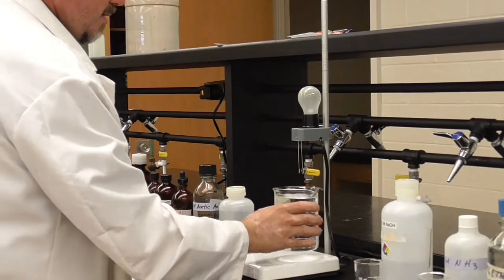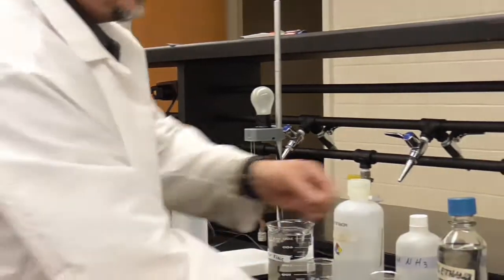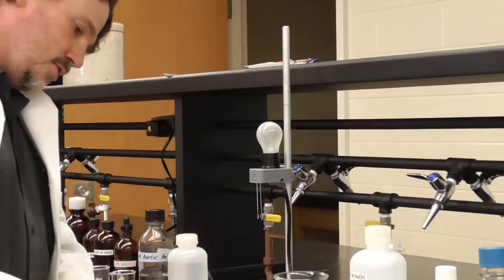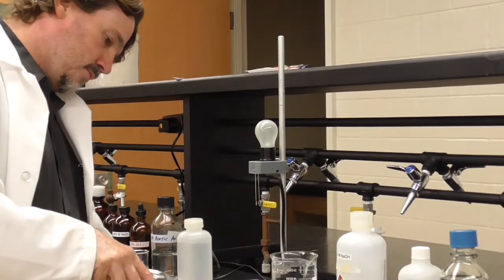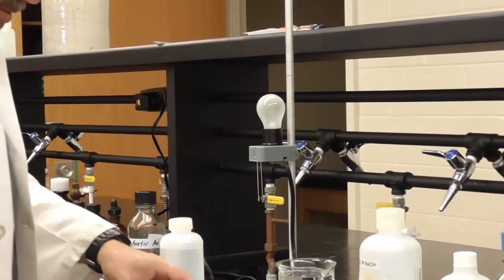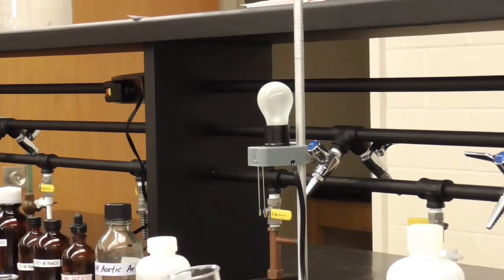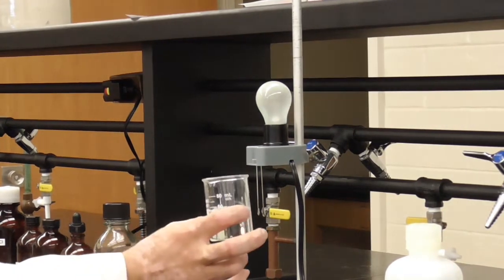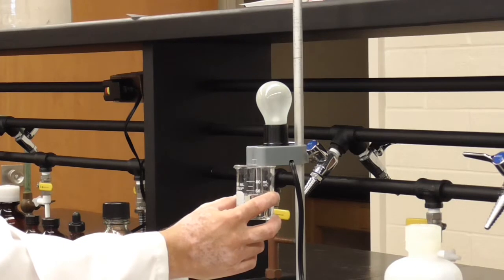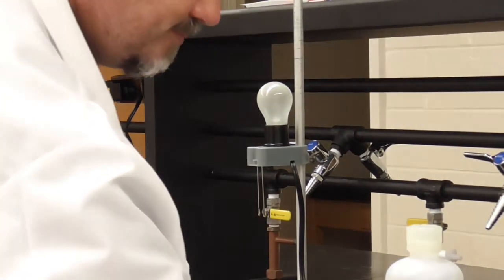Let's rinse that off. Next is 0.1 molar glucose. So here is 0.1 molar glucose. Glucose is blood sugar. Anybody going into the health field, you better know that one, right? Blood sugar. So what's in your blood, how your body actually distributes those carbohydrates to every cell in your body. So glucose, 0.1 molar glucose, here we go. Nothing. Nothing at all. Okay.